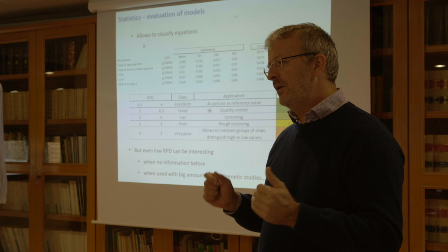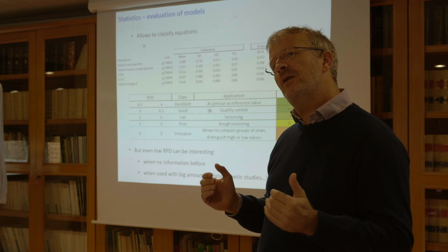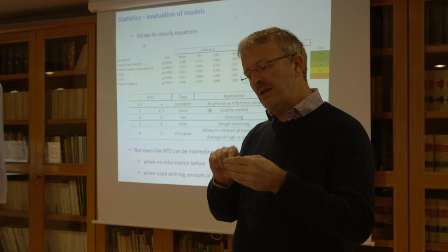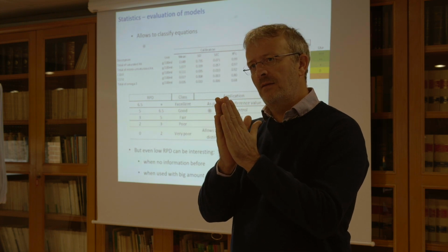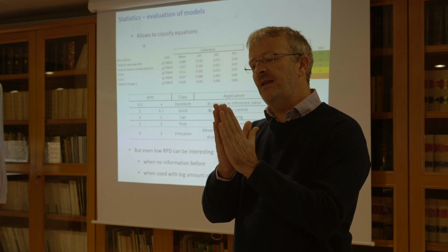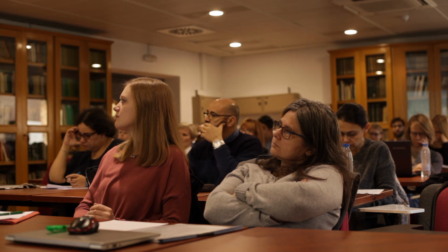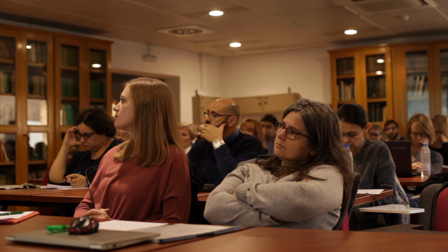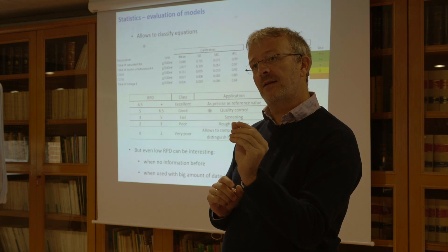It's a little bit complicated to explain why, but it depends on the energy of the waves, because with the mid-infrared we have a lower energy, and it means that you need to use a very thin cell. Very thin cells means that you have a very thin part of the samples that can be measured, samples without water. When we say thin, it's very thin. It's a micrometer length of the cell.